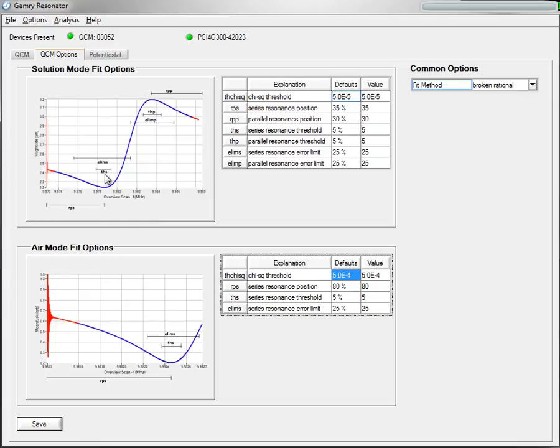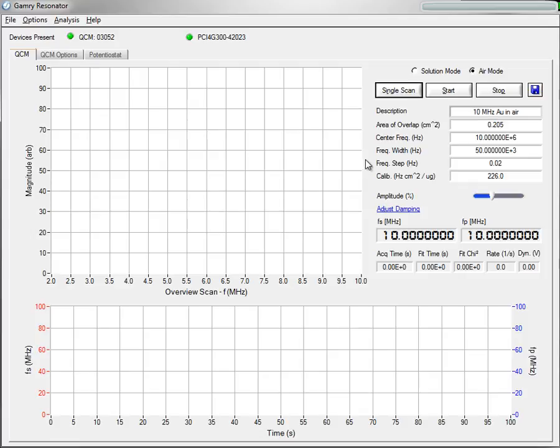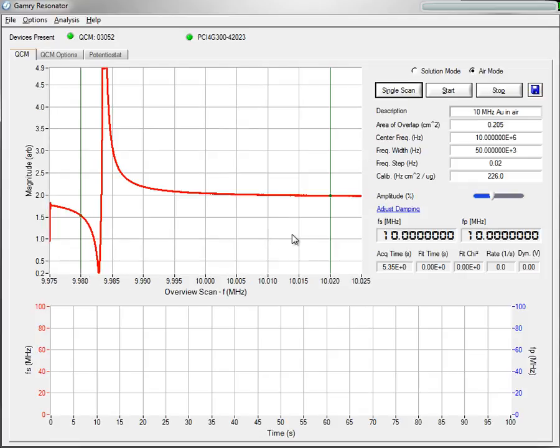The difference between the Solution Mode and Air Mode is shown graphically here. Now what I'm going to do, just like normal, I'm going to press Single Scan. And that's going to show the full scan here.